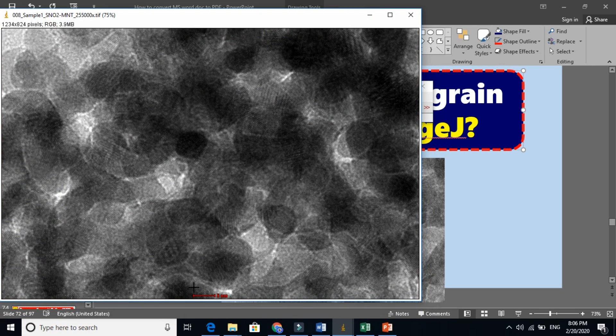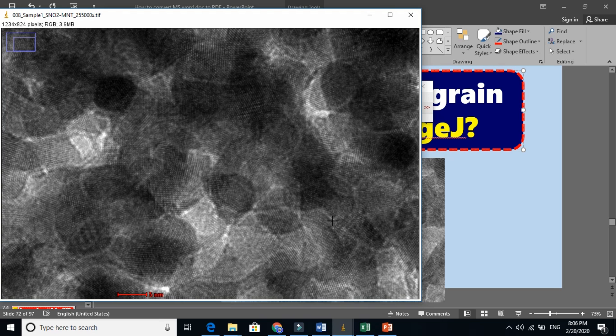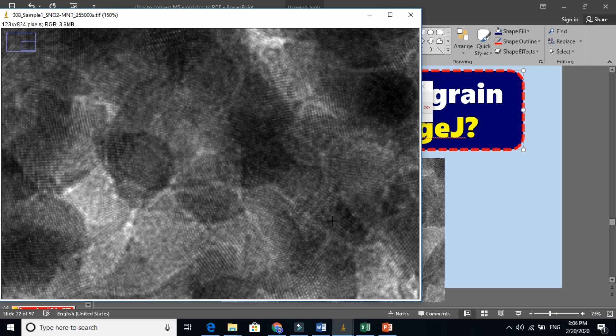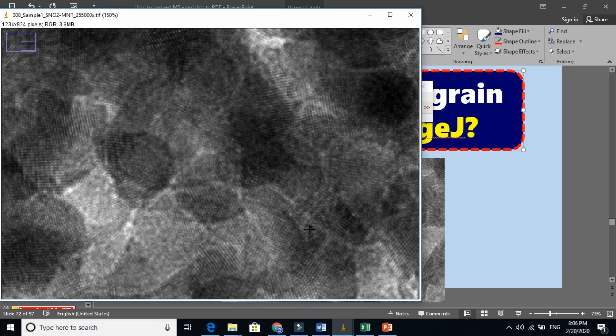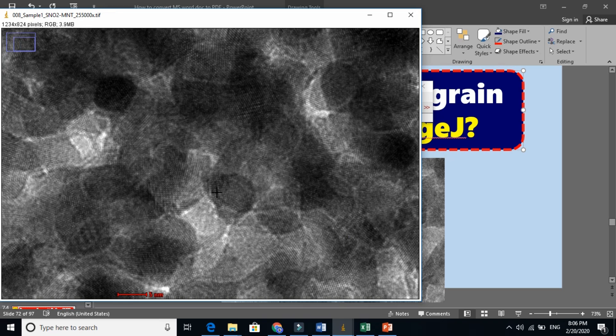The scale is 5 nanometer. If you don't see it, I will zoom it here, and you will see that the scale is here. The 5 nanometer here.